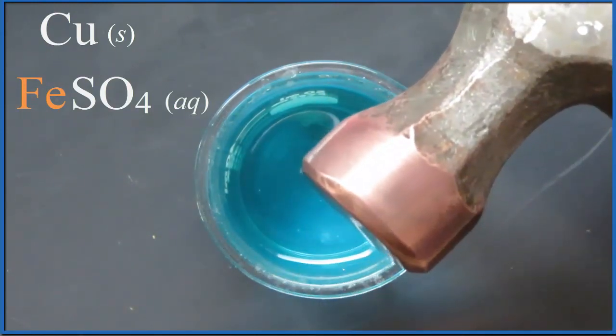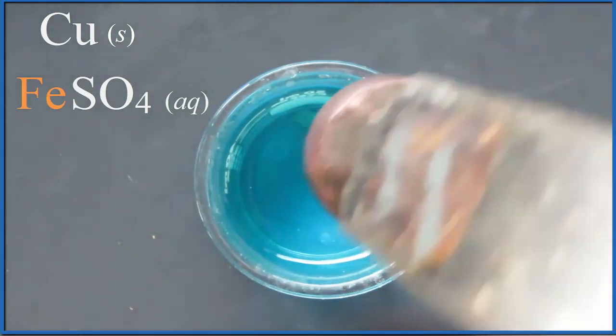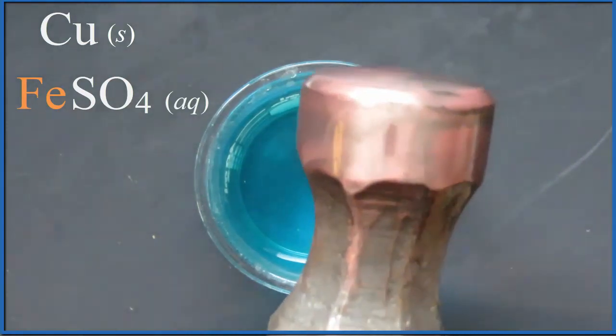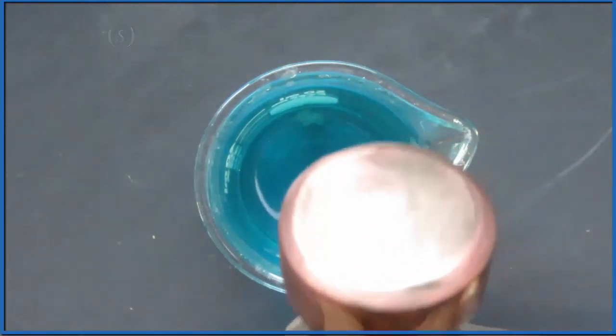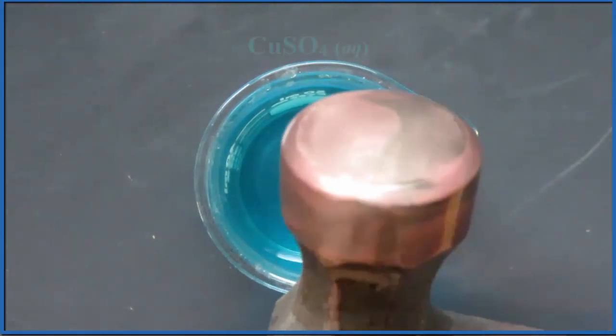So the iron, it's replacing the copper. We start out with this copper sulfate dissolved in water, that's the blue. And the iron from the hammer, that replaces some of the copper in that blue solution in the beaker.